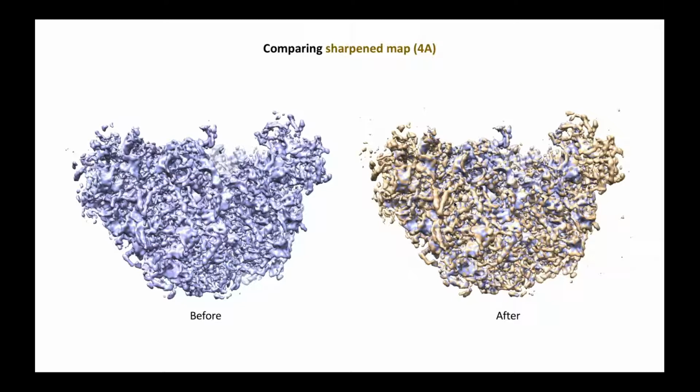Jessica will talk in more detail about the Chimera tool to manipulate or to play around with your maps and structures and models.